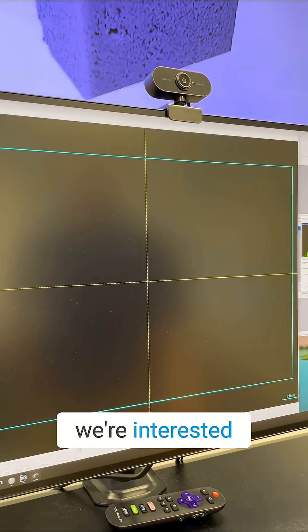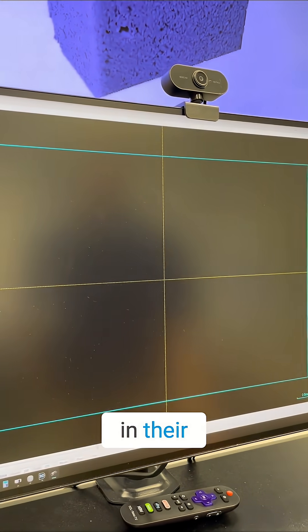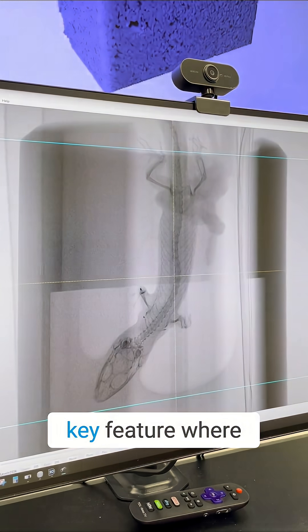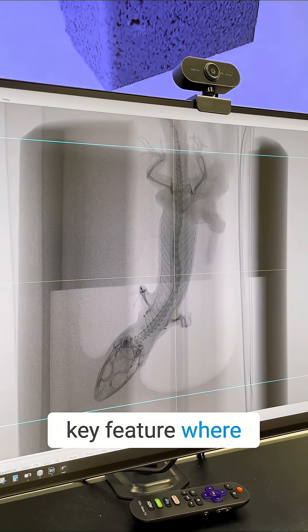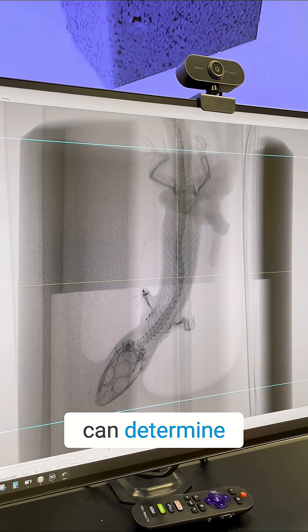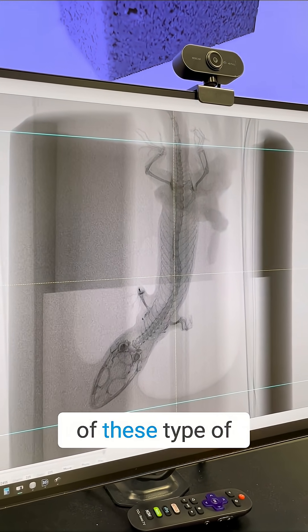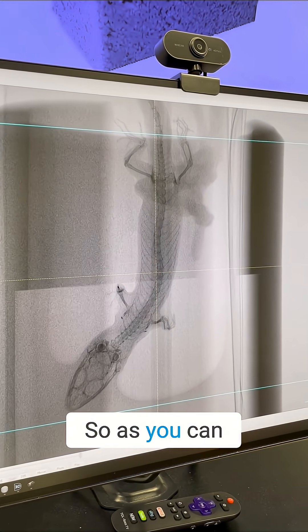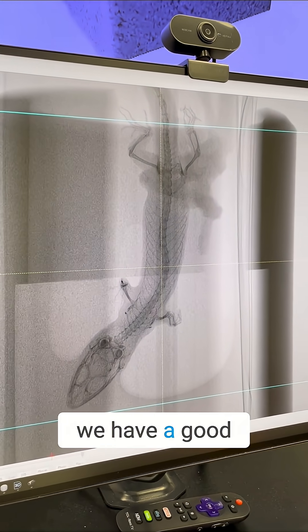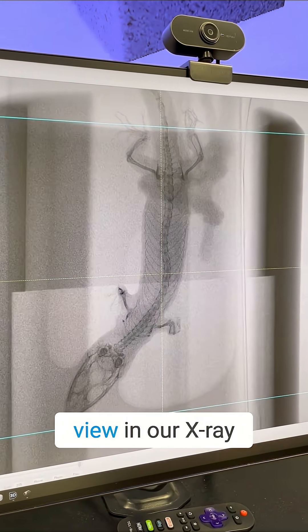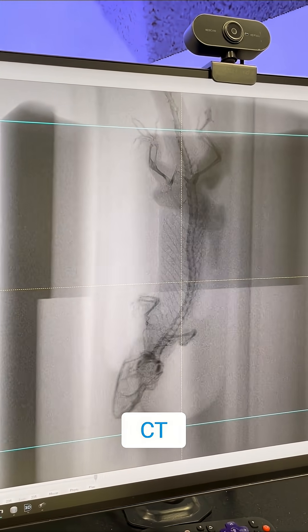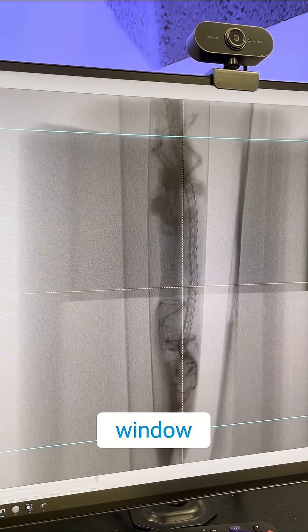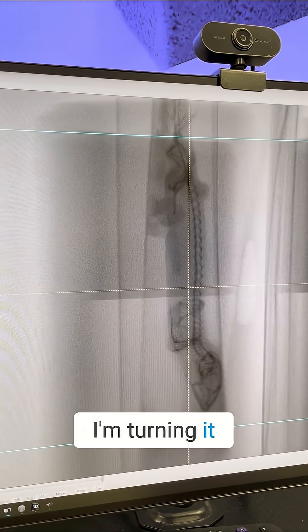We're interested in their bone structure because it is a key feature where you can determine the species of these types of geckos. As you can see here, we have a good view in our X-ray CT viewing window — you can see I'm turning it around.